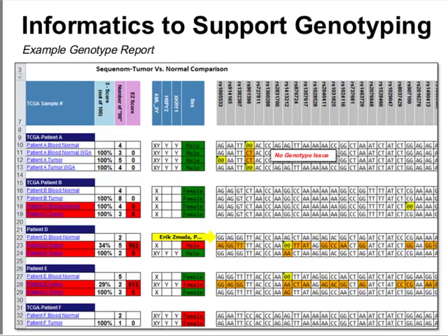So this first example is the perfect case. There's no genotype issues. We have a nice match between the germline normal and the tumor, and TCGA did do whole genome amplification, and we genotyped those as well, and there were never issues detecting the genotype on WGA. The next example is a scenario where a duplicate patient was submitted. So we see patient B and patient C are showing up. They all have a perfect genotype match to each other. You inspect the raw data and it checks out.